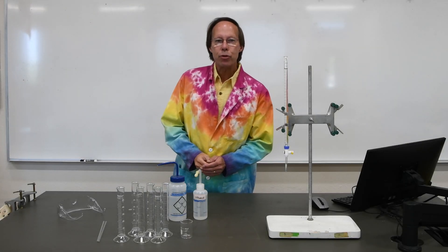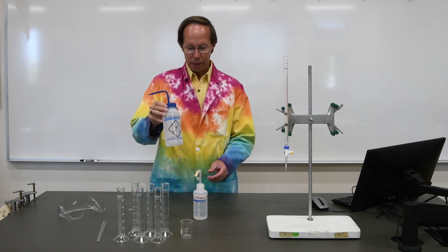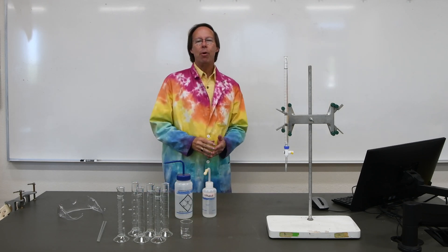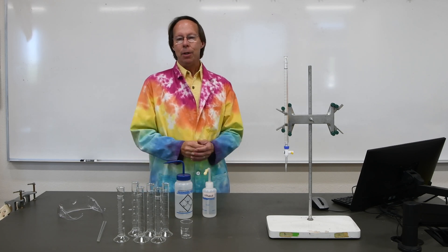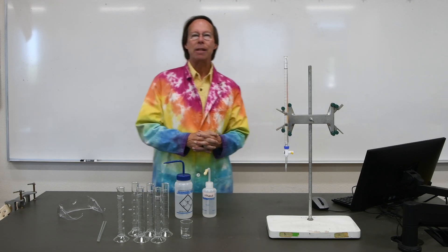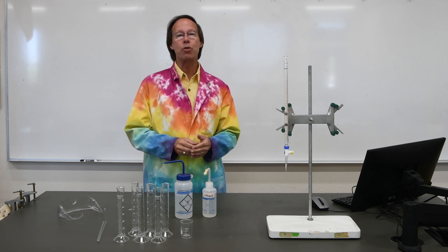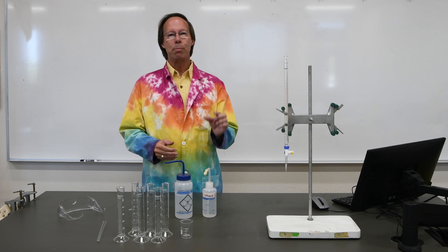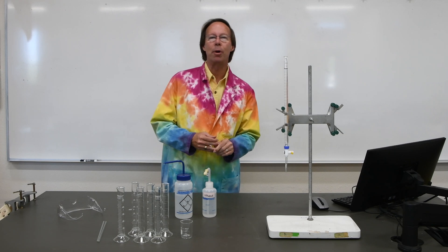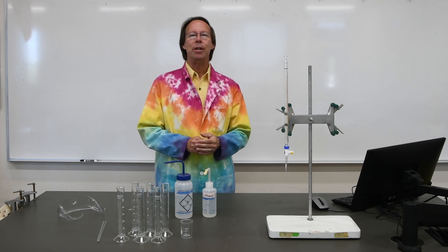Now we're going to repeat that first series using two different liquids — deionized water and ethanol. When two different liquids are mixed together, the volumes are not commonly additive. Because the molecules are different sizes, they tend to fit in between each other, and usually the volume of the two together will be less than the sum of the two individually. It's like mixing ping pong balls and marbles together — the marbles fit in between the spaces of the ping pong balls, and the total space is less than what it would be if you simply added them together.